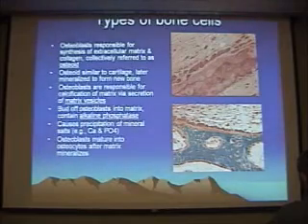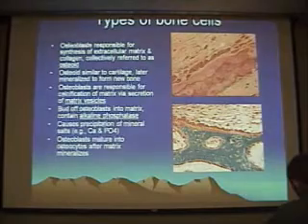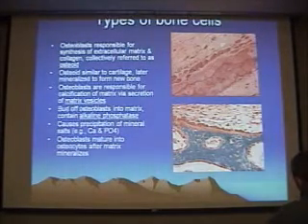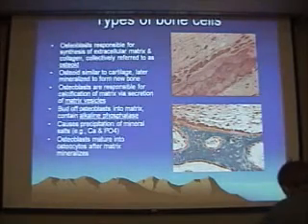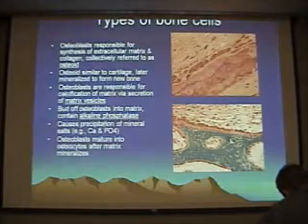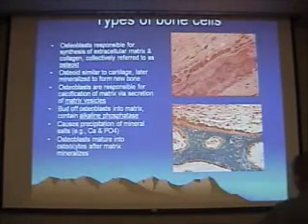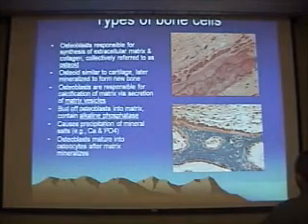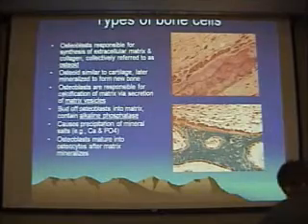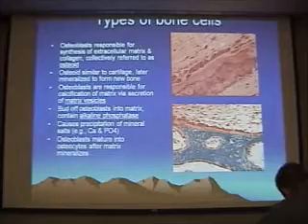Here we have a special stain which highlights very nicely these osteoblasts. They often row up, almost like a row of bricks at the edge of a wall. Here you can see the unmineralized matrix in pink, and then the mineralized bone in this nice turquoise color. During this process, some of these osteoblasts invariably become trapped within the matrix that they're secreting. Once that happens, they will then mature into osteocytes. So these cells, which become trapped within matrix, within lacunae, within the matrix, are the osteocytes.